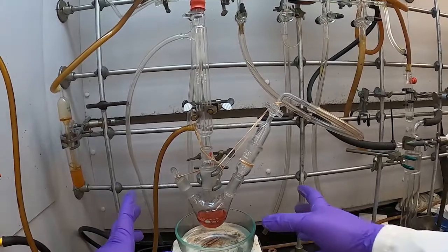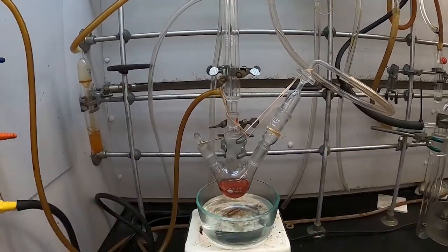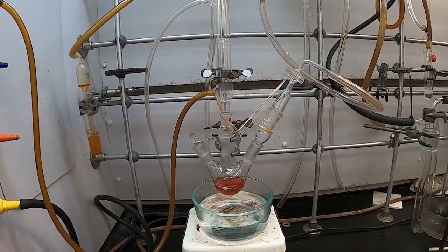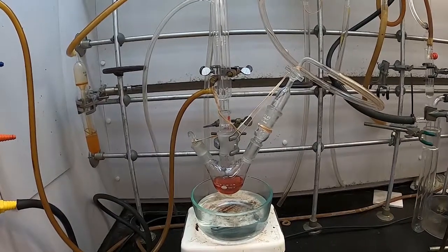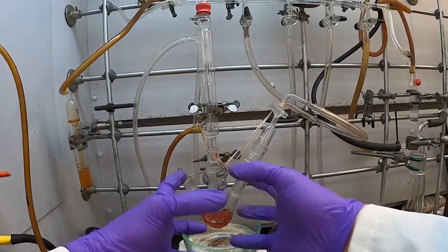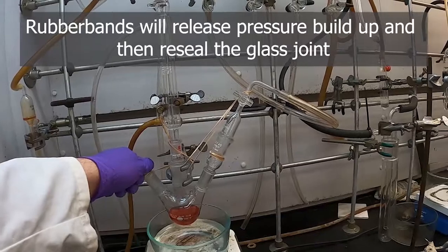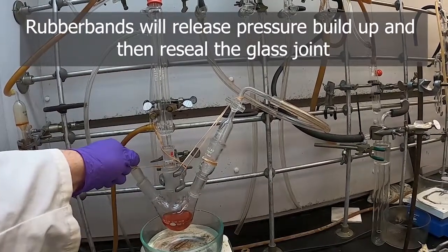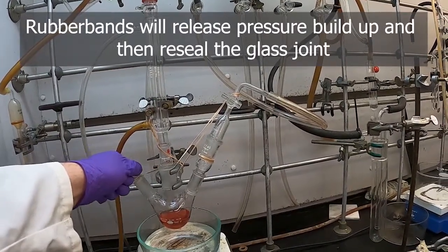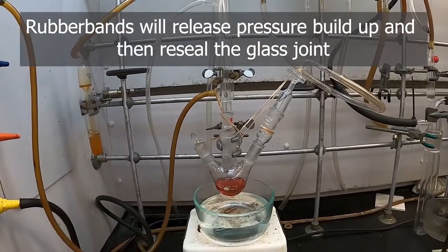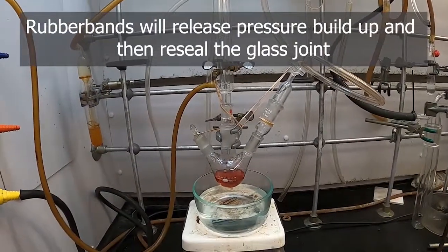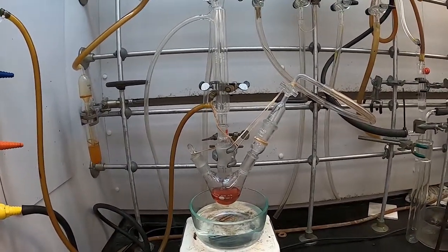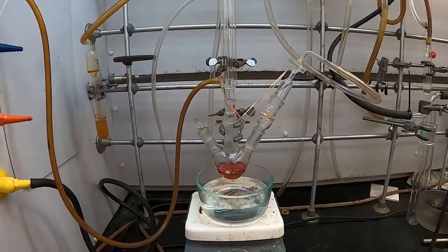The rubber bands are very important during the heating phase so that when as the reaction warms up, if pressure builds anywhere, the glass joint can pop and then return to the position so we don't have pieces of glass flying off and the reaction being exposed to atmosphere.